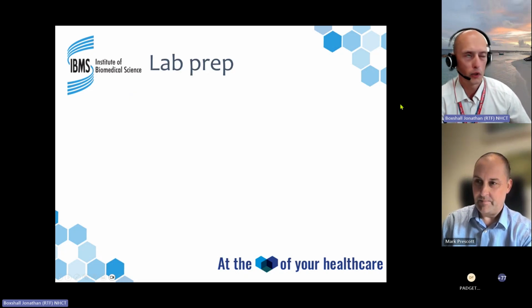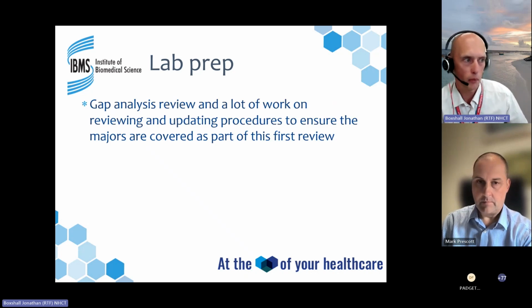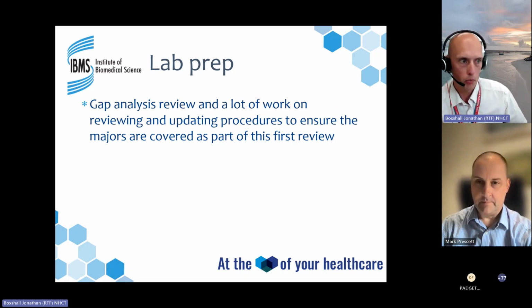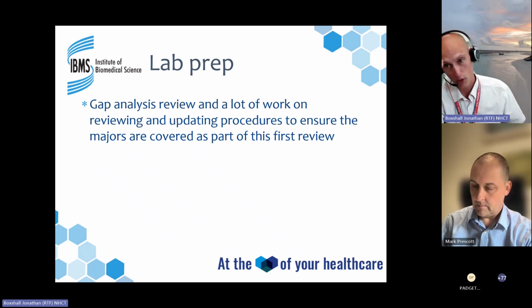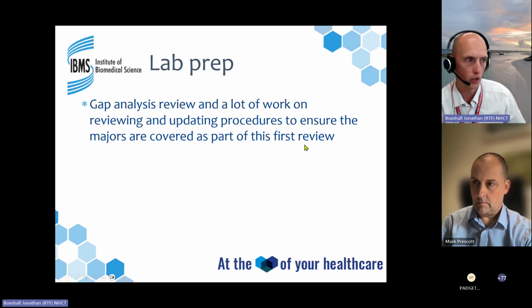So what did we do? Well, effectively, I've done exactly what Mark said. We had to do a gap analysis review and loads of work on reviewing and updating procedures to ensure all the majors are covered at least. So I went through, knowing from technical assessing that that's what we were going to be focusing on. So that's what I made sure we focused on within our lab. So we did a lot of the majors and any of the moderates. Even some of the minors were picked up because any quick wins were done as well, but we really did focus on making sure we covered a lot of the majors.